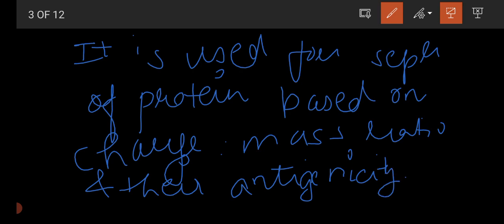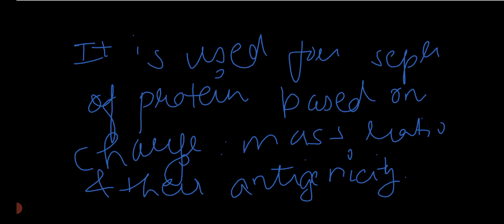So this is the thing. You can just note it down, or you can take a screenshot of this. This is a short definition of immunoelectrophoresis, so you may write this whenever it is asked.